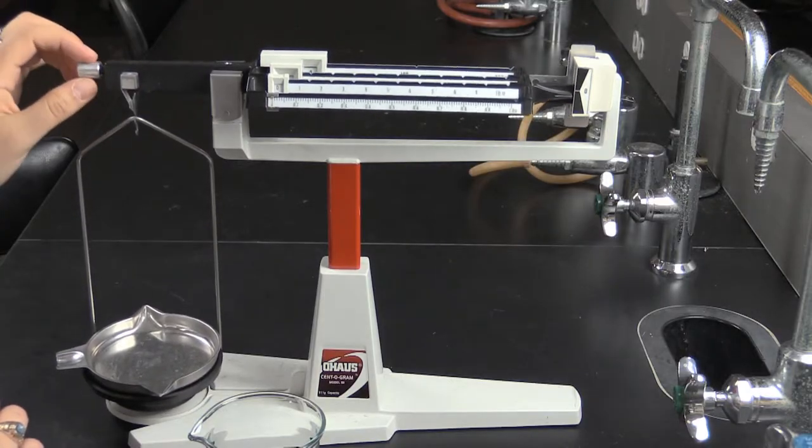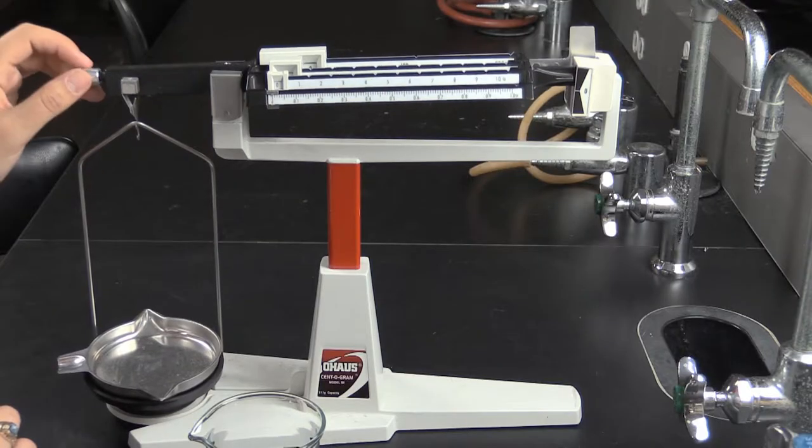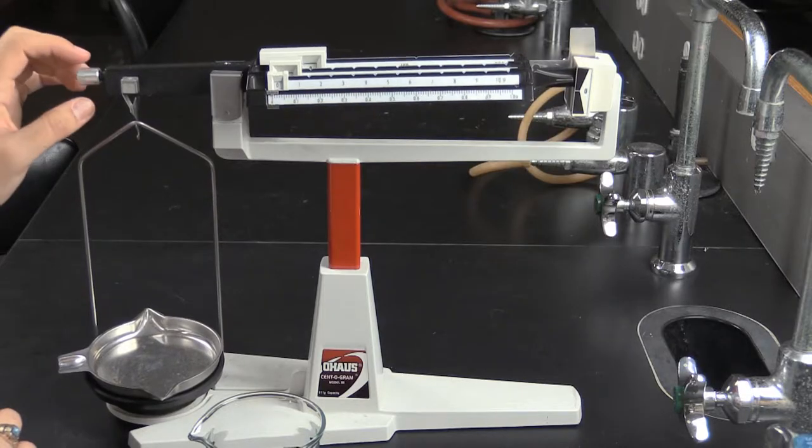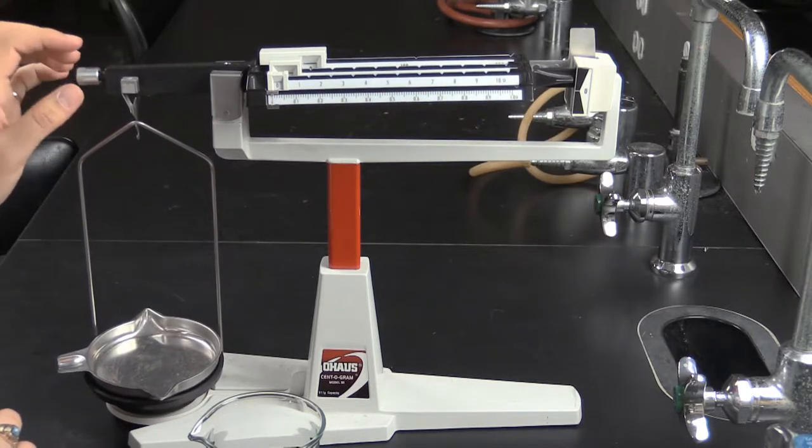Once in this position, the knurled nut on the left side of the beam is loosened or tightened until the beam line on the right lines up with the line on the fixed portion of the balance.